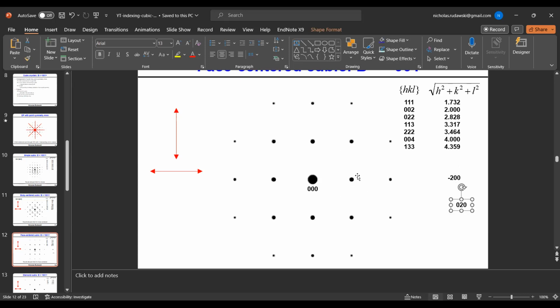So now we'll start by assuming that the G vectors are in the 1, 1, 1 family, okay? So first question, can we assign indices to 2 1, 1, 1 G vectors so that I get a 0 dot product? Okay, answer is no. It's not mathematically possible. You can do it yourselves and prove it. But that's not mathematically possible.